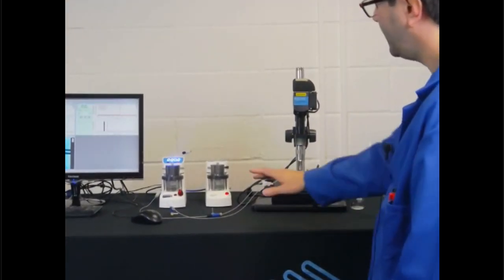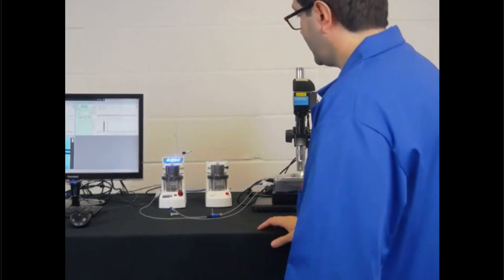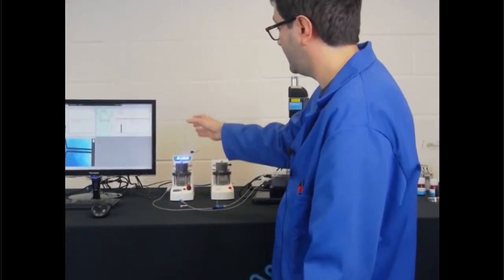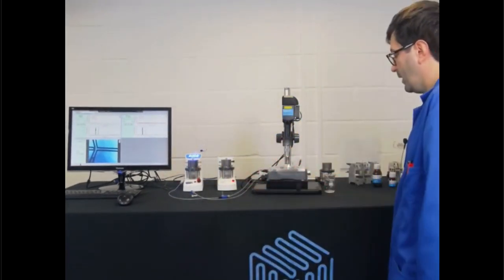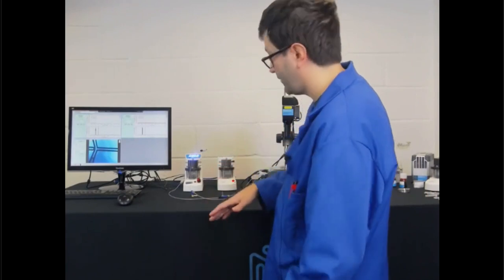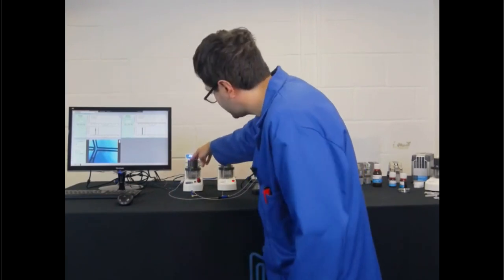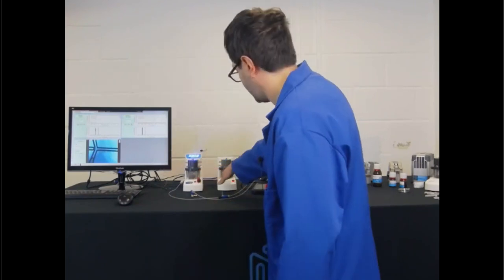The software is the FCC. The two pumps here are pressure-driven pumps, which means that there are no mechanical elements involved in the pumping system, so the fluid can be nicely driven from the small reservoir where the two fluids are contained to the chip in a pulseless and smooth manner. If you think about the application I was mentioning before, there is one fluid which is the aqueous fluid, and another fluid which is the lipid stream. The lipids are dissolved in ethanol and are kept within this small reservoir, and the water is in the other one.